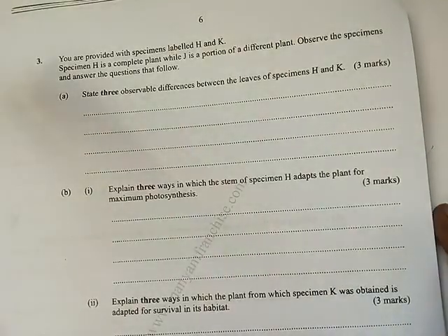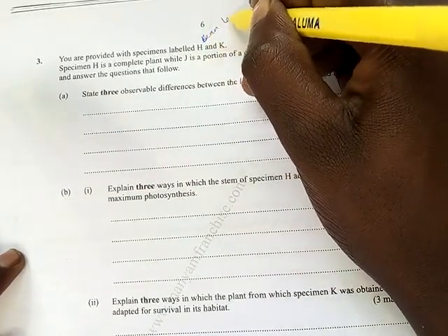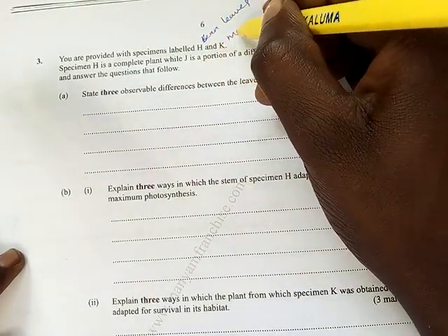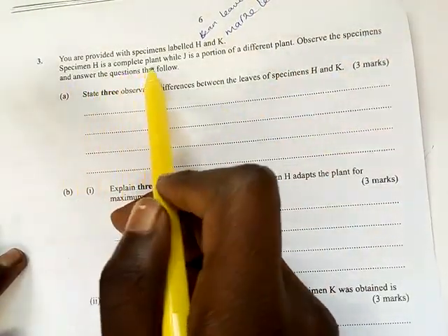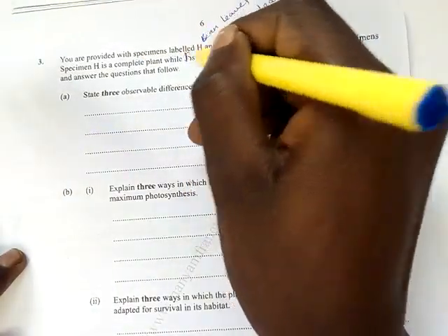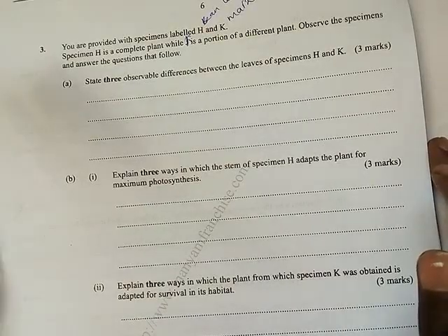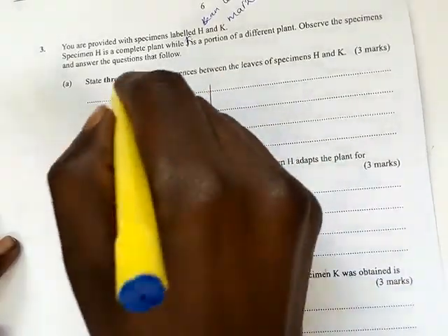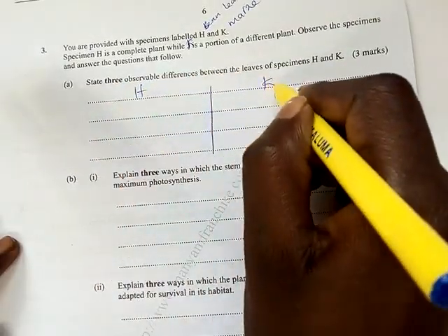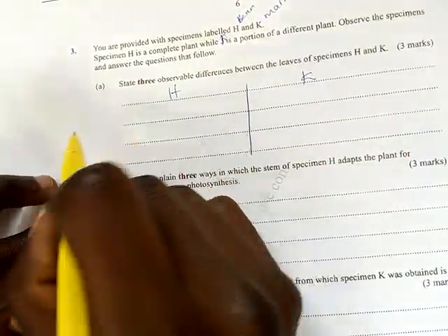In question 3, you are provided with the specimen labeled H and K. H was the bean leaves, while K was the maize leaf. Now, specimen H is a complete plant, while K is a portion of the plant. Observe and answer the question. State 3 observable features between H and K. Now this is H, this is K.